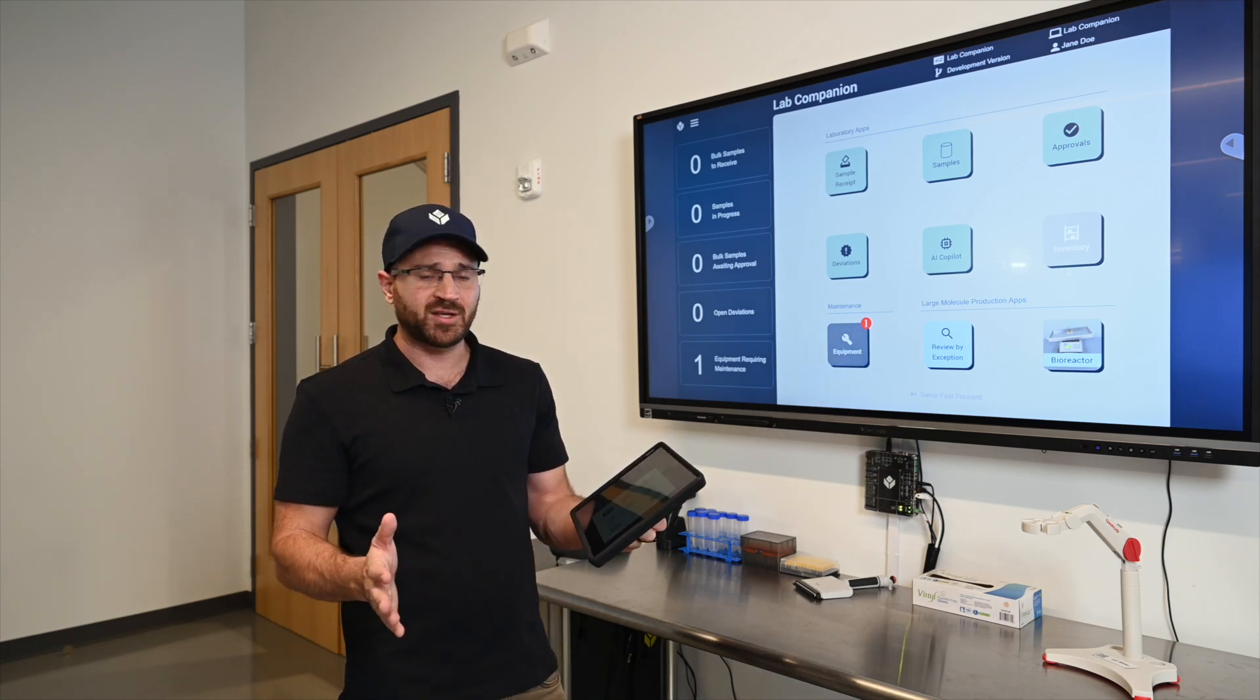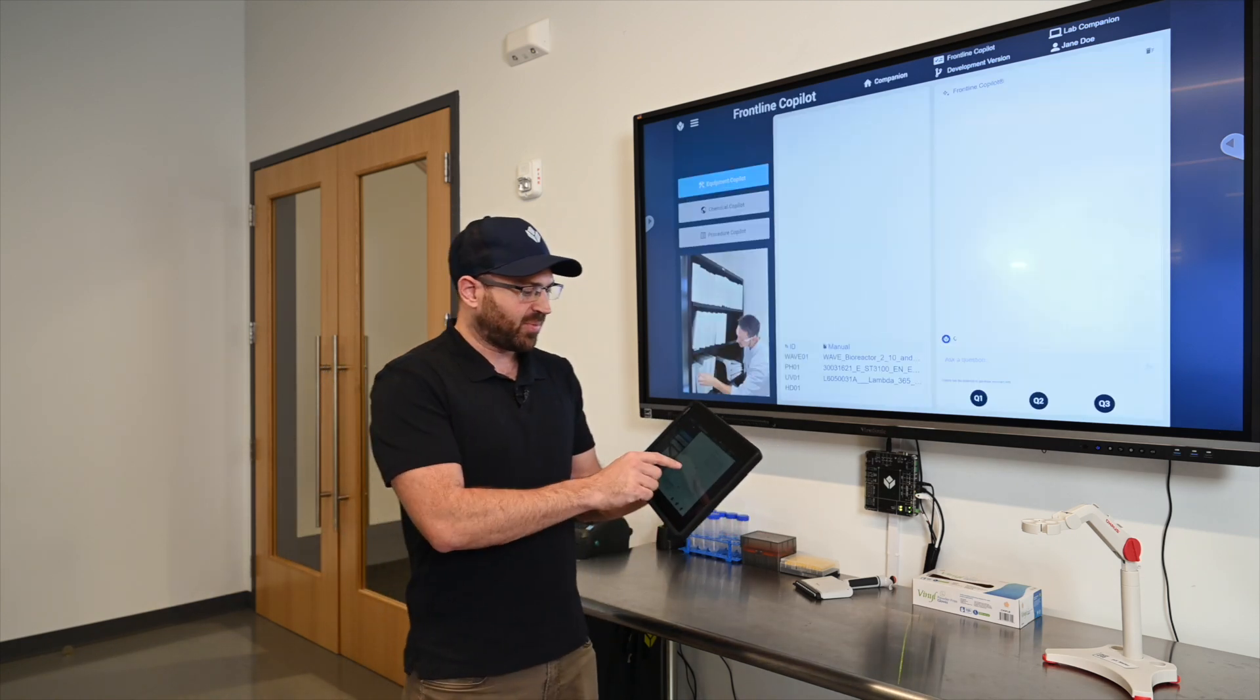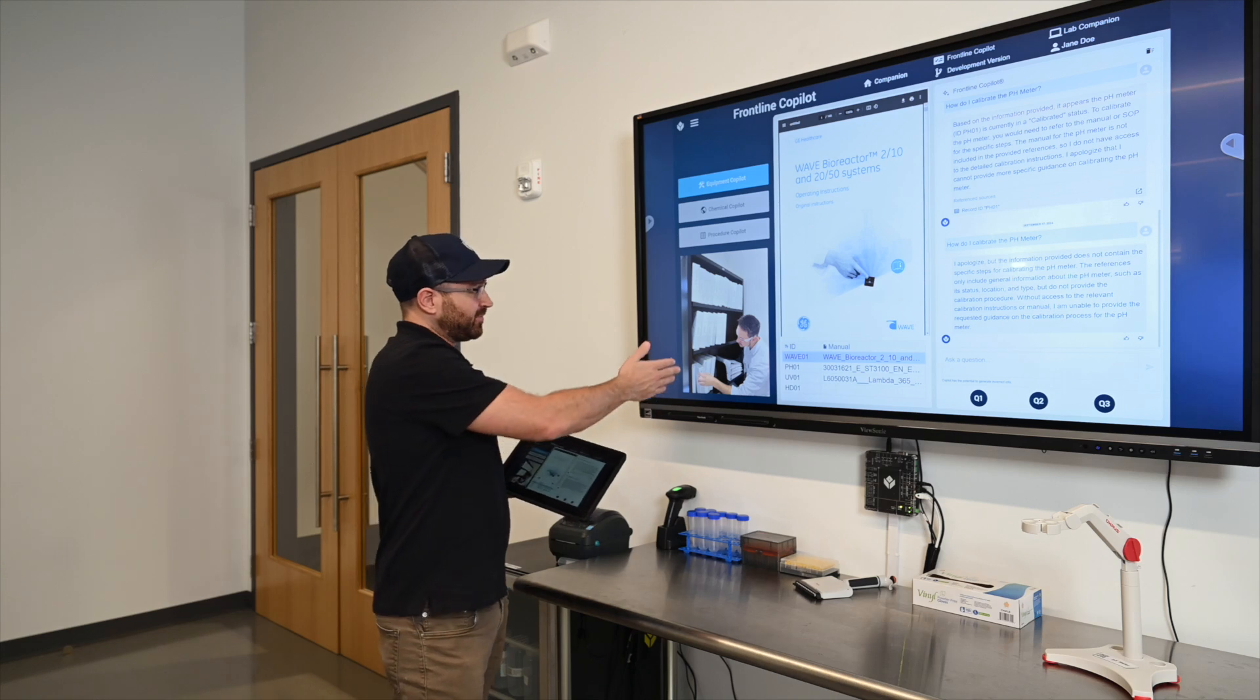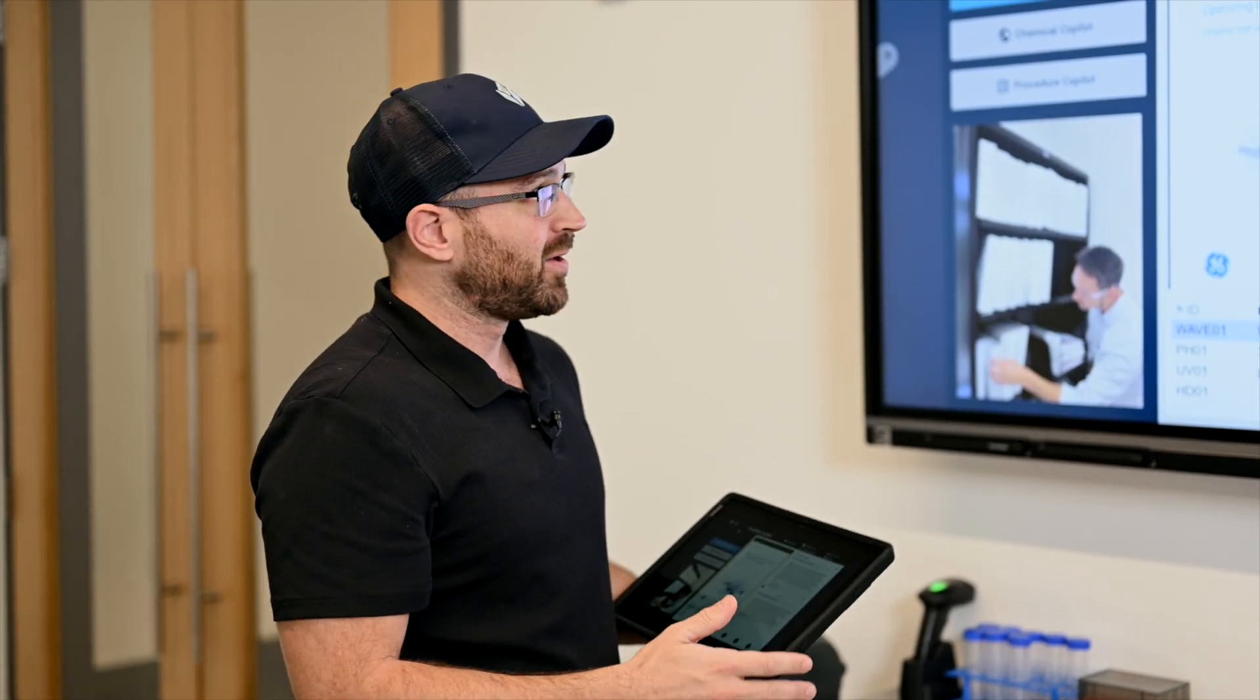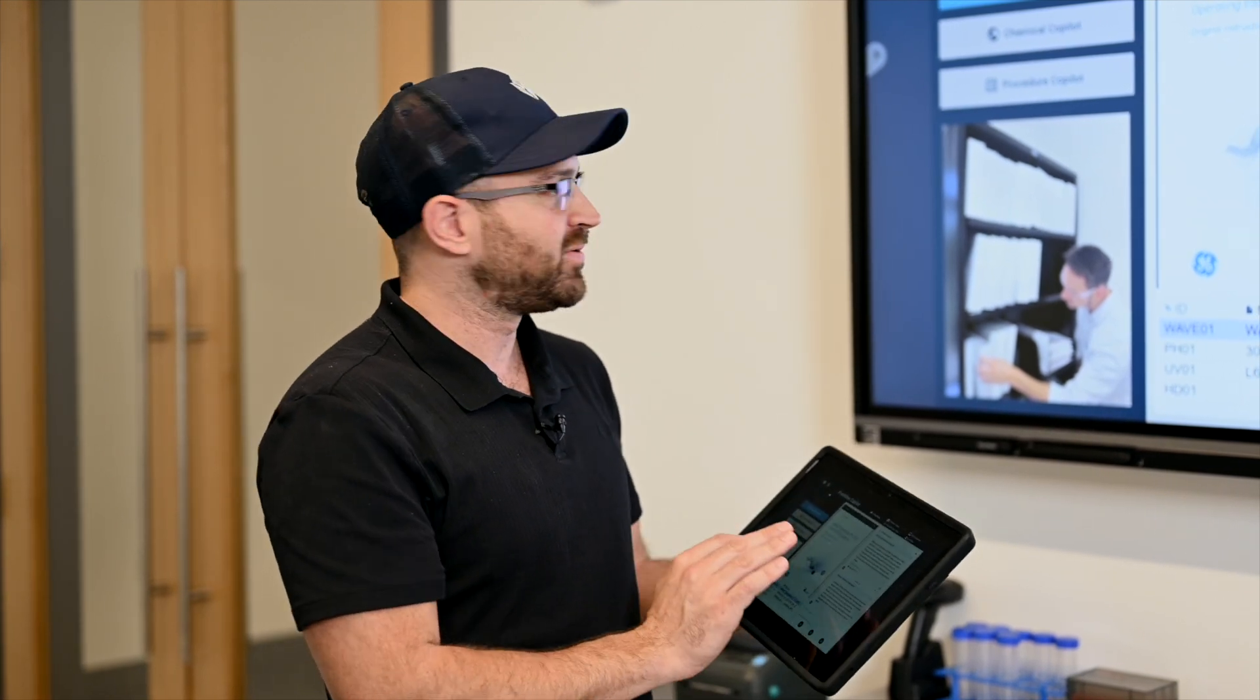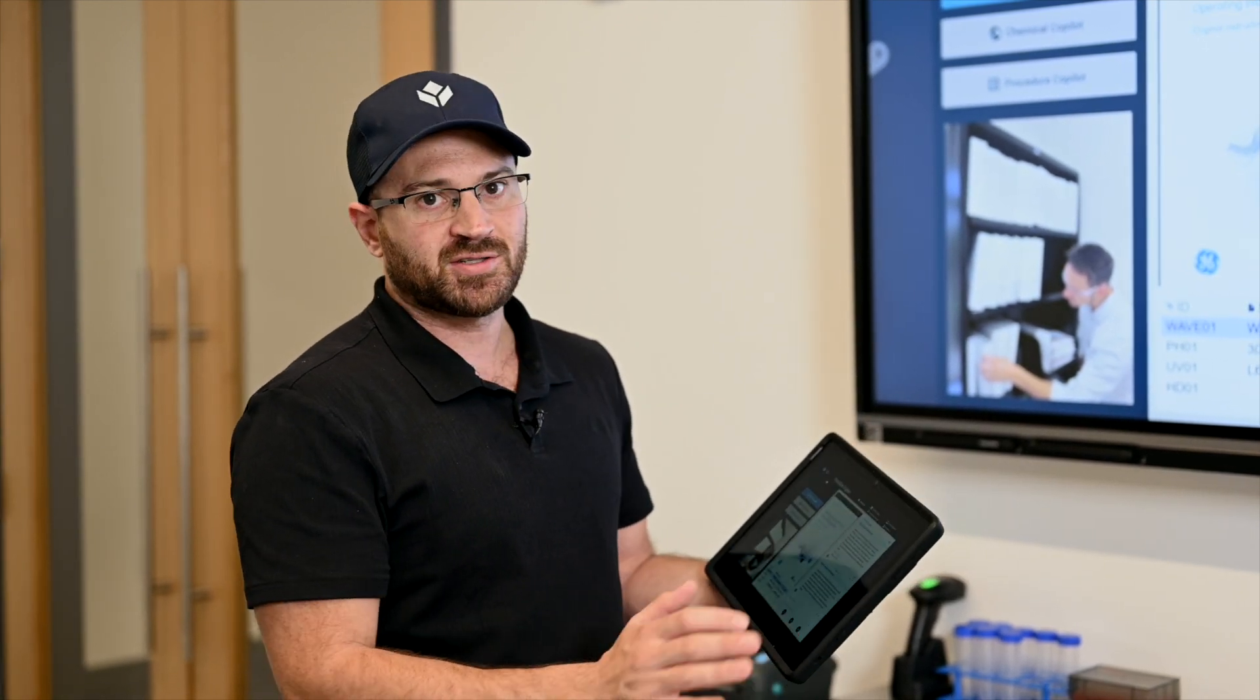There's a couple other things we added here too which I want to highlight. One of them is the Frontline Copilot. I can select this Copilot application. This is more of a general purpose application but typically what you'll find is in a lab or production environment you'll see a number of documents in a big bookshelf that show this is where you would go to find procedures and answer questions. With TULIP, TULIP can be trained on all of these different procedures and you can actually ask questions directly of these. So instead of searching through a library of books you can actually talk directly to these instructions and get answers to your questions on the fly.